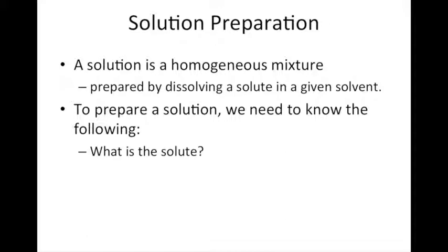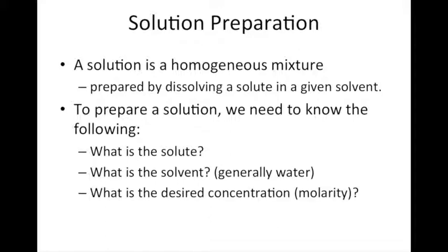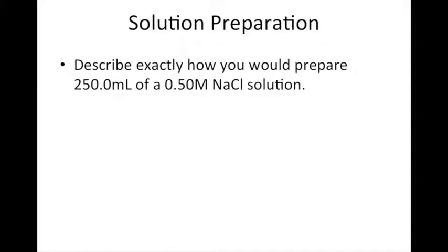First of all, we need to know what solute we want to use to make our solution. We want to know what solvent we need to dissolve our solute in. Generally, it's going to be water. What molarity do we want our final solution to be? And what volume do we want our final solution to be at? So if we know these four things, we should have enough information to prepare a proper solution.